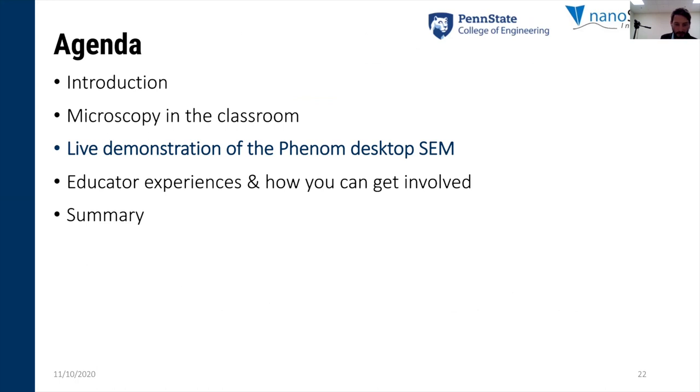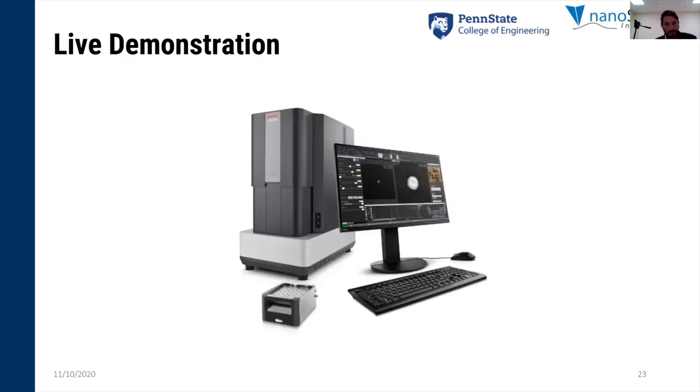So at this point, I'm going to show you in real time what this microscope looks like and how I can use it. I'm going to control it from the same laptop I'm projecting this PowerPoint from. And then after that, we're going to turn it over to Bob and Oscar for a questions break, and then we're going to go to our panelists, and they're going to talk very practically about what they're doing with remote education.